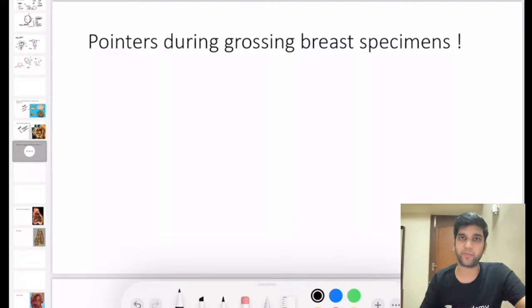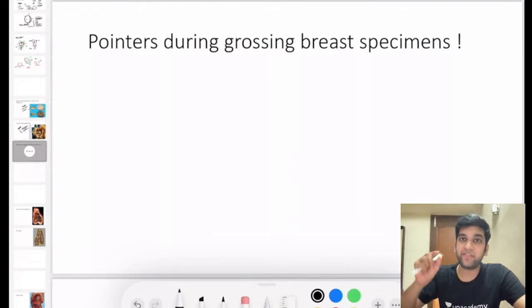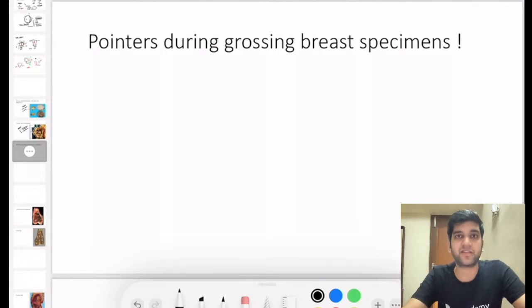Obviously, the orientation of the breast is important. You know that long lateral and short superior is the general dictum. You go with that as well. Serially cut. And when I say serially cut, the cut should be very, very perfect. It should extend from the posterior aspect, it should go till your skin. It should be perfectly serial, right? Don't leave a little bit before the skin, because that's the general thing that we won't do completely, right?